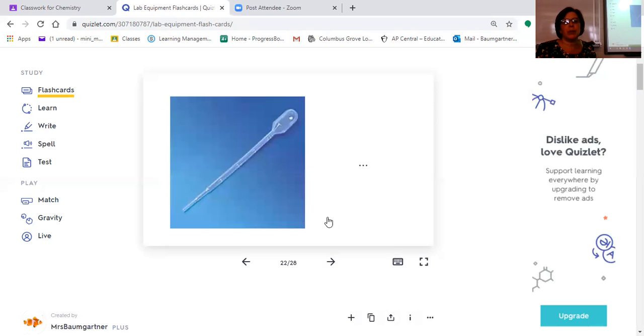And next to that, we probably have, oh, disposable pipette. You guys will use these a lot. They're the little plastic, poor man's version of a pipette. And if we need to add a couple of drops, we'll use these. We'll throw them away when we're done.